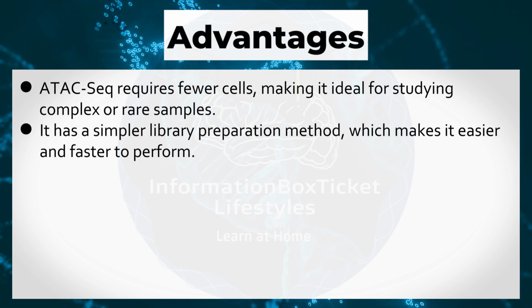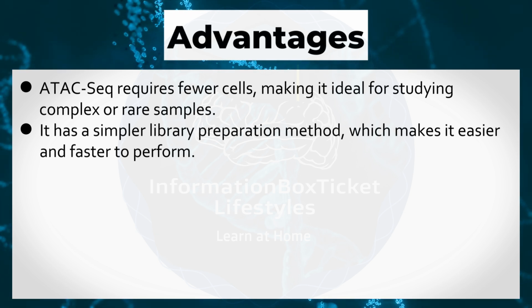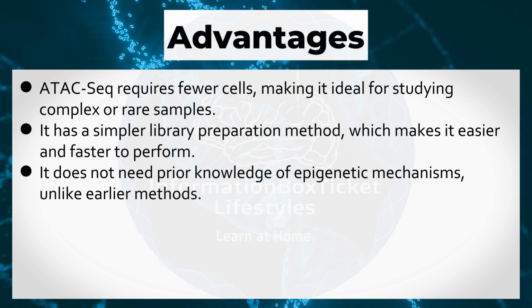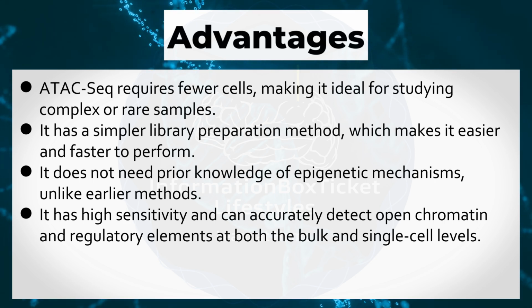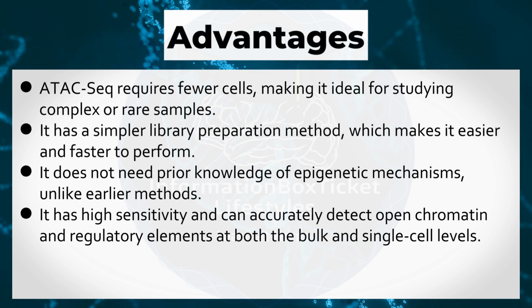It has a simpler library preparation method, which makes it easier and faster to perform. It does not need prior knowledge of epigenetic mechanisms, unlike earlier methods. It has high sensitivity and can accurately detect open chromatin and regulatory elements at both the bulk and single-cell levels.